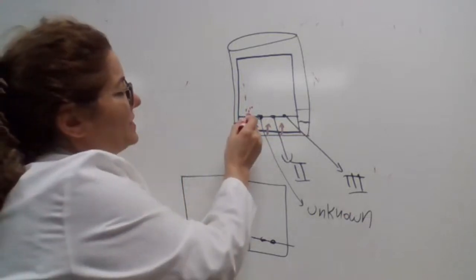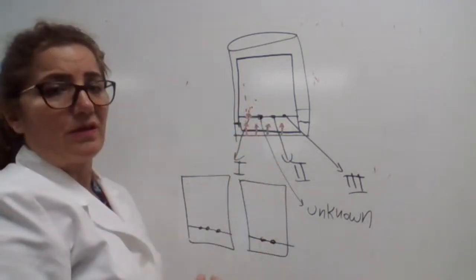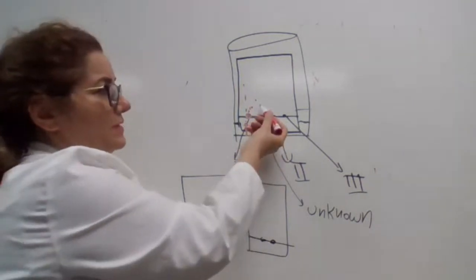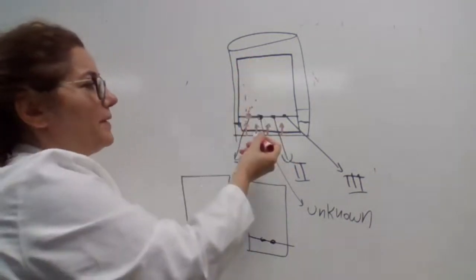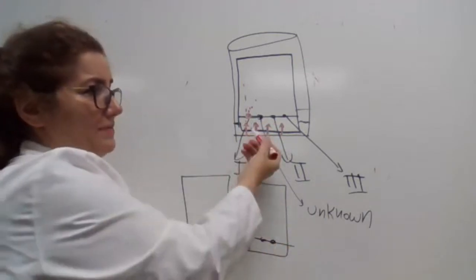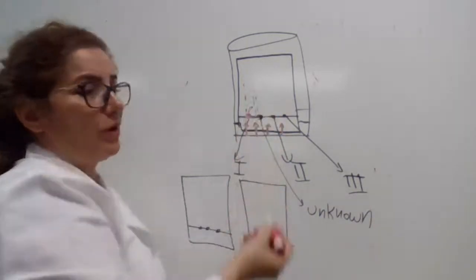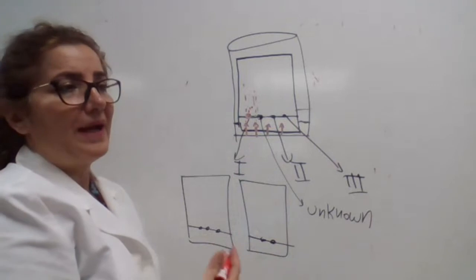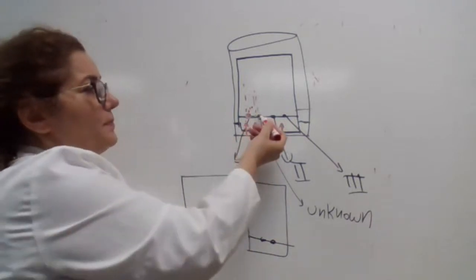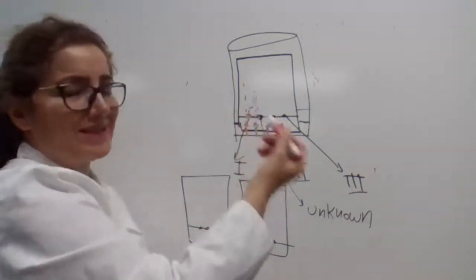Now, if your sample is non-polar and the stationary phase is polar, there is really no interaction, no interest of that sample in the stationary phase, and it wants to move up, especially with the solvent that you have. It is non-polar, so it's the same nature as your sample. As the solvent moves up, the sample is also going to move up, and you have to pick a proper solvent to move the sample with it, but your sample should not move as fast as the solvent.